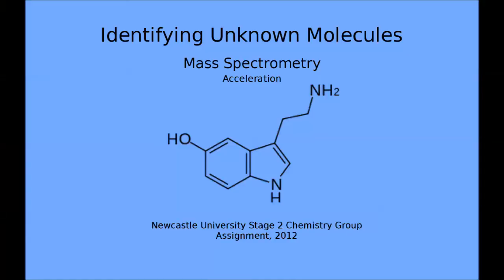These positive ions are persuaded out to the rest of the machine by the ion repeller, which is another metal plate carrying a slightly positive charge. The positive ions are repelled away from the very positive ionization chamber and pass through 3 slits, the final one of which is at 0 volts. And the middle slit carries some intermediate voltage. All the ions are accelerated into a finely focused beam.